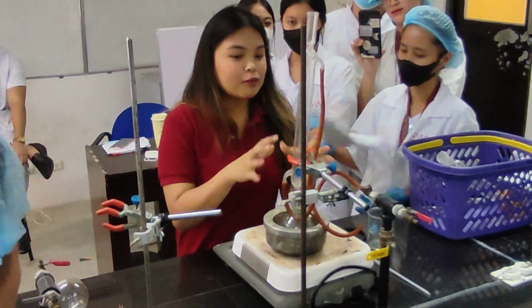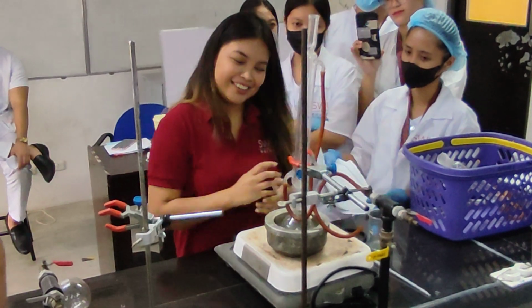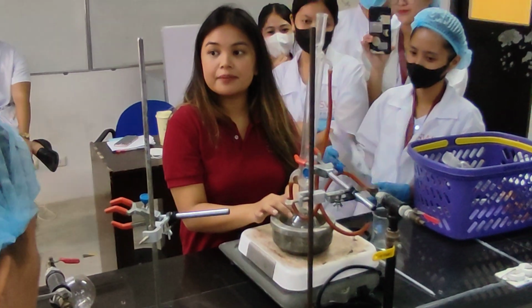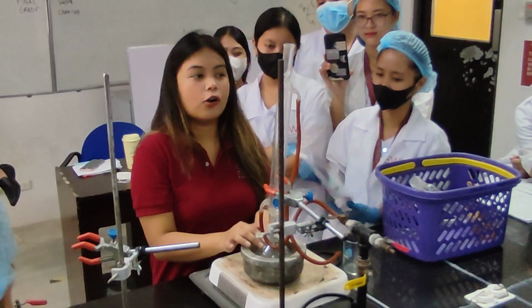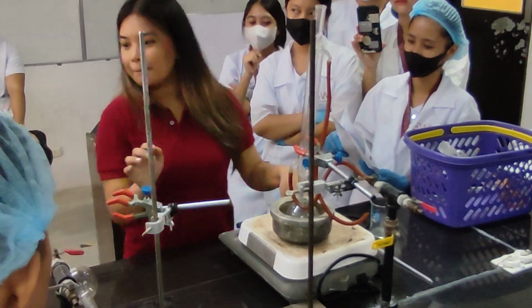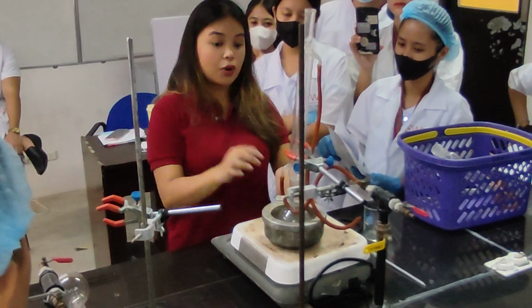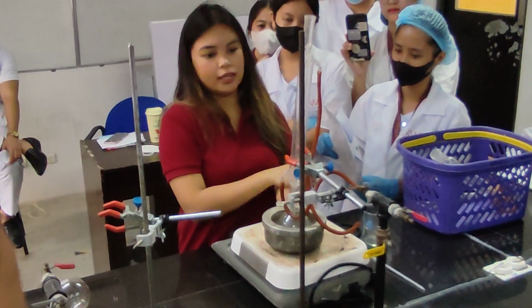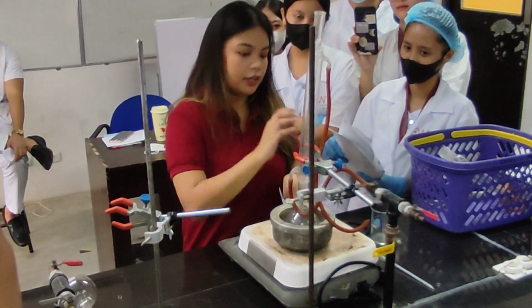If the earlier one was very easy, now there is reflux heating, the setup, the water bath. What is this one, guys? Distilling. This one is the condenser. Your clamps should be there.